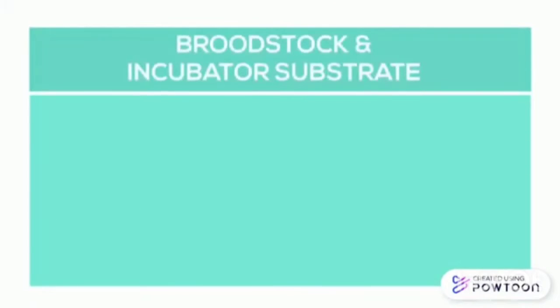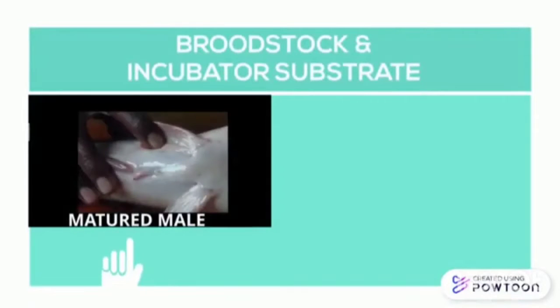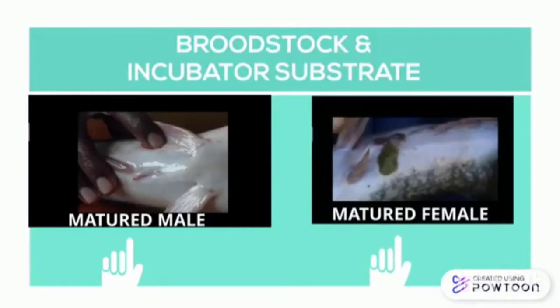Broodstock and incubator substrate. To select broodstock, for sexually prepared males, the sexual papilla is usually red at the tip, while for the identification of mature female catfish, a gentle press on the belly towards the genital opening will release the ripe eggs that show the readiness and viability of the female.